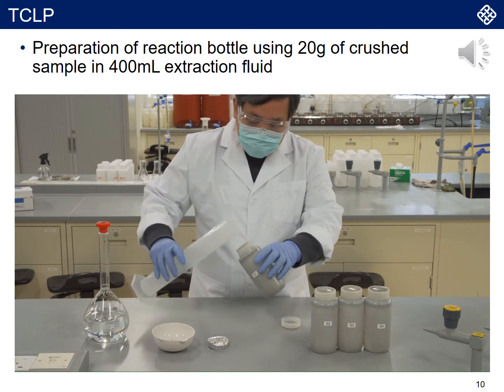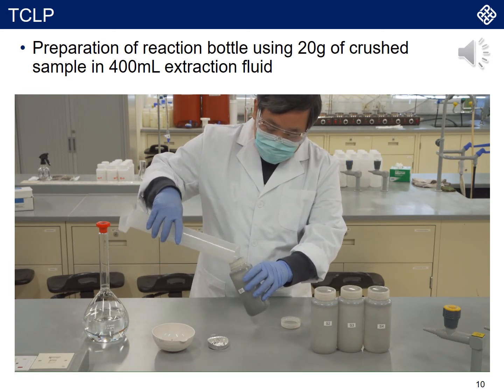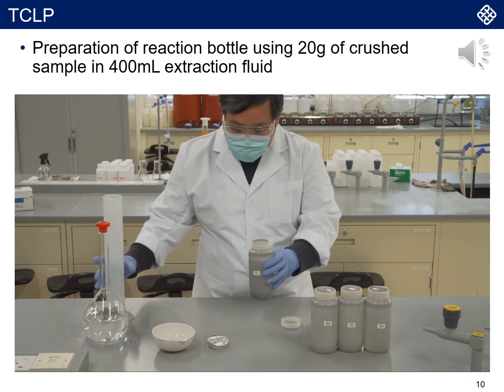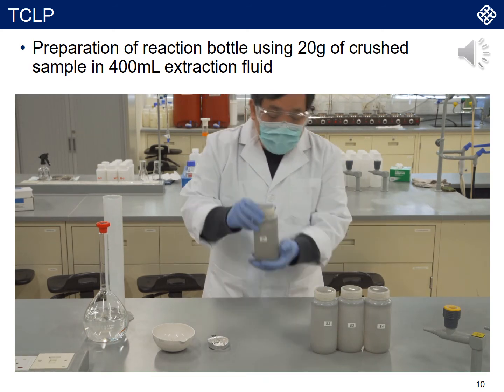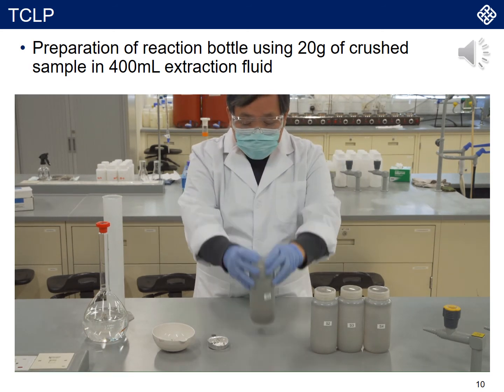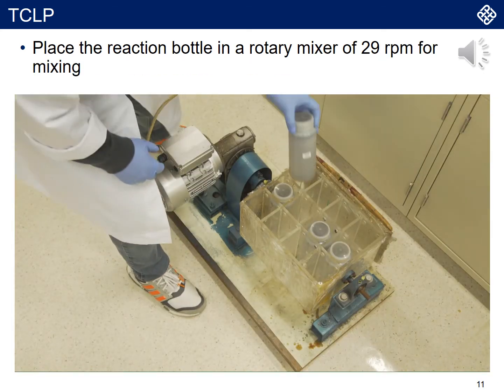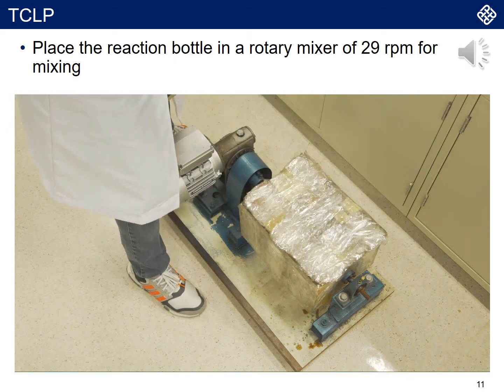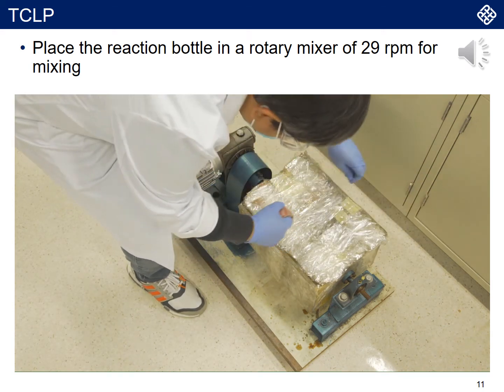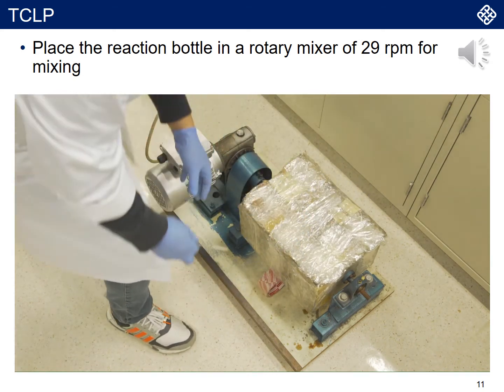And then anyhow, you can see extraction solutions have been poured into the bottle, including the samples. What you need to do is just shake it, mix it, and then wait a while. That's it. This stage is also very straightforward, and I think you can easily get the concept from the video without too much detail from my explanations.